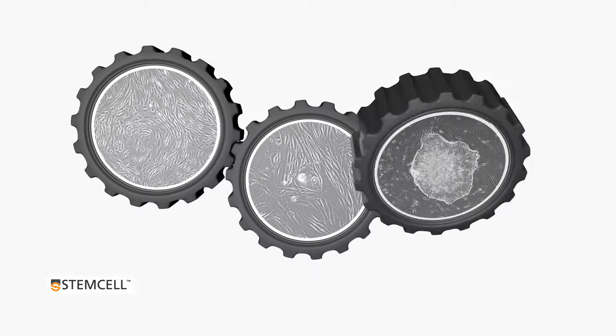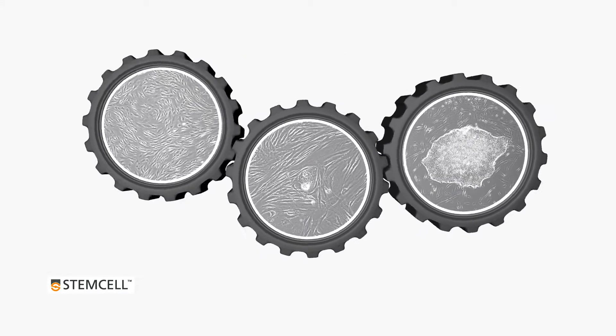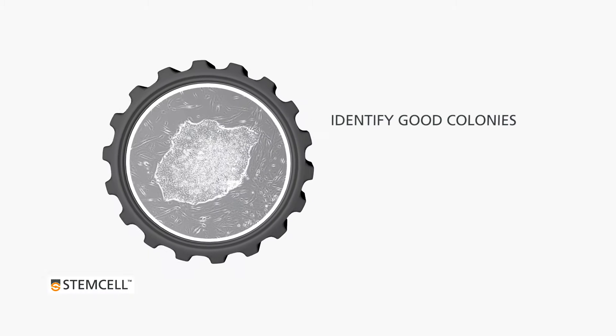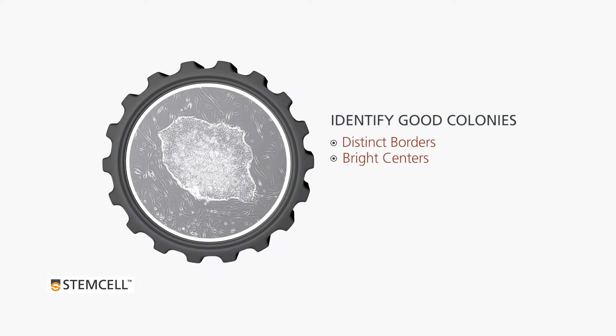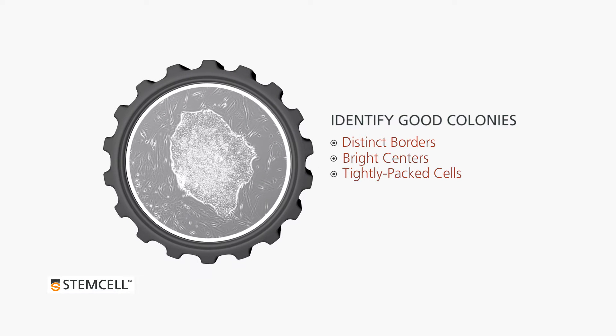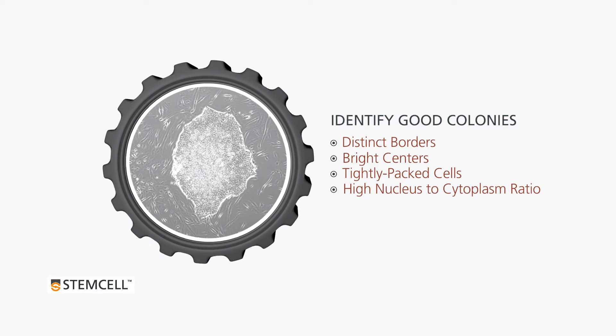When you are ready to harvest your reprogrammed IPSC colonies, select the colonies that look most like ES colonies. Look for distinct borders, bright centers, tightly packed cells with prominent nucleoli, and a high ratio of nucleus to cytoplasm.